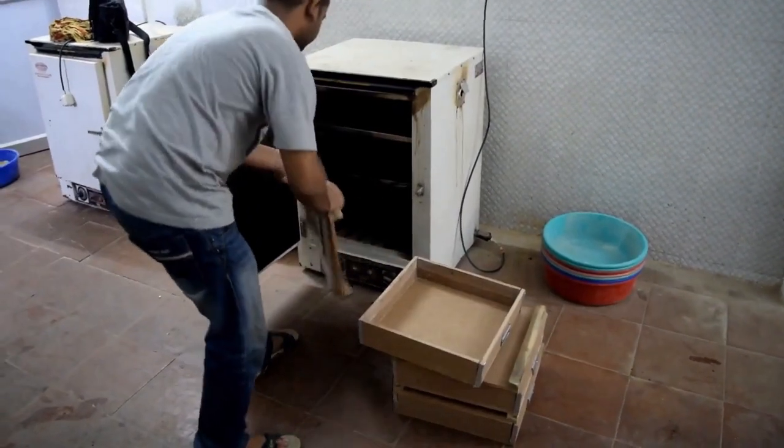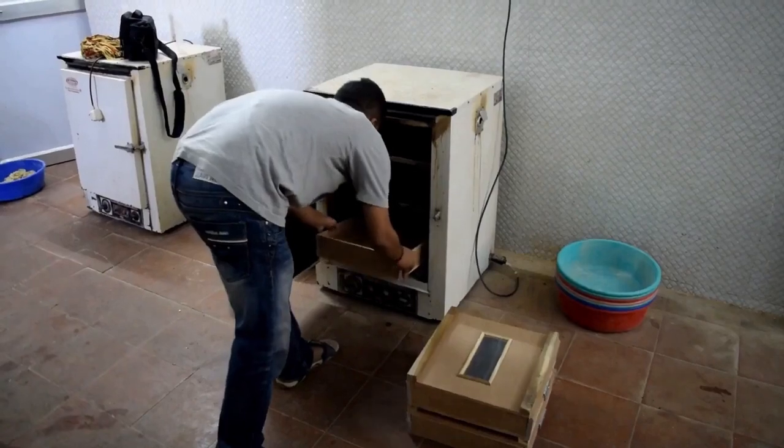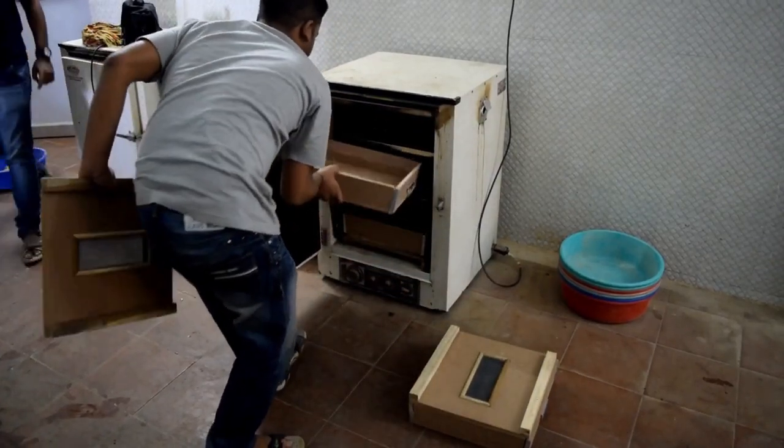The clean boxes are being treated in hot air oven at 100 degrees Celsius for 30 minutes to kill the pathogens and eggs of different store grain pests.